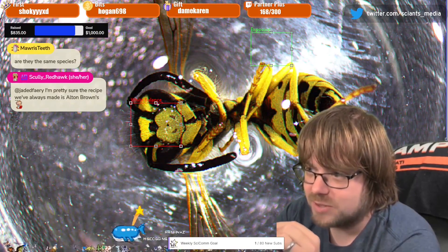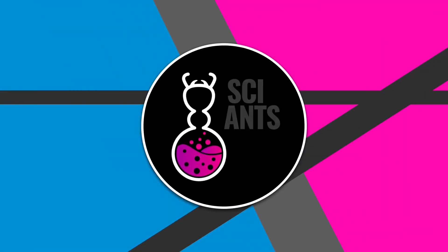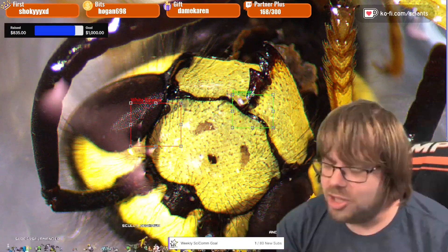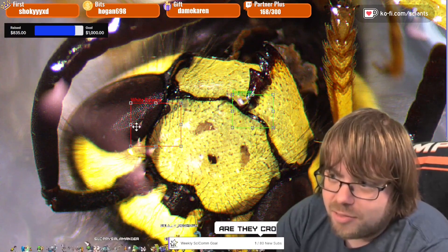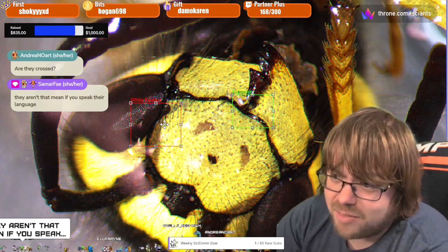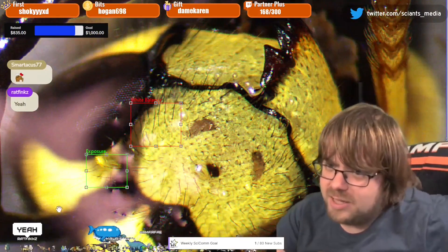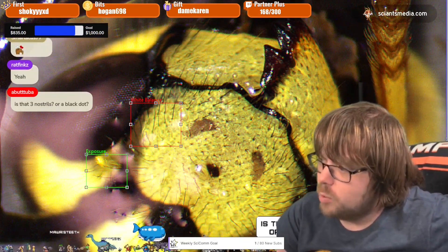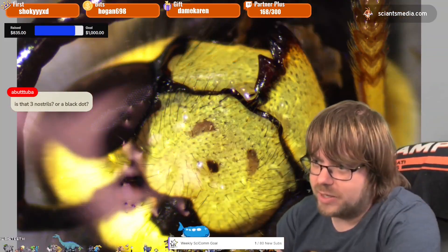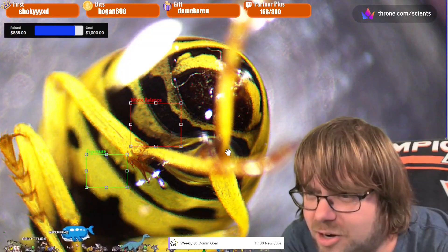I'm really excited to look closer into this one's face - look at that beauty. You can all see the red boxes that say white balance, and you can actually see these little dots here. Those little dots are the omatidium, or the eye cells. We can even see on that res right here, and if we get on top of her head, further down there are going to be additional cells called the ocelli - the false eyes - which detect UV light and give the animal a sense of direction. This is just some coloring here, not a great view of the stinger.